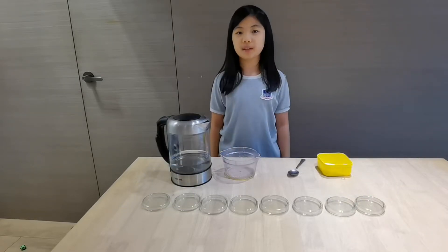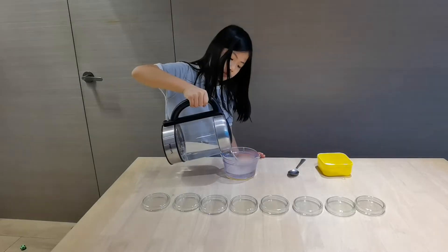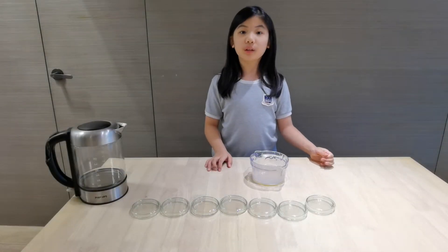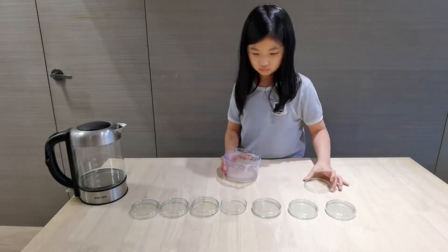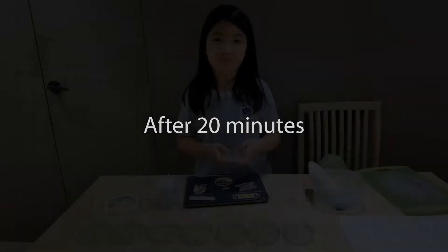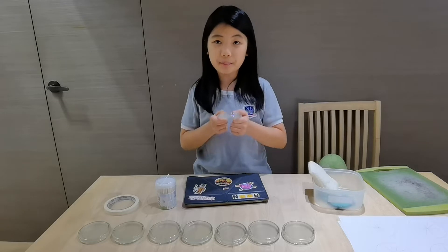I need to mix the agar powder into hot water. Now I will pour the agar into each petri dish. Now the agar jellies are ready for growing some bacteria.